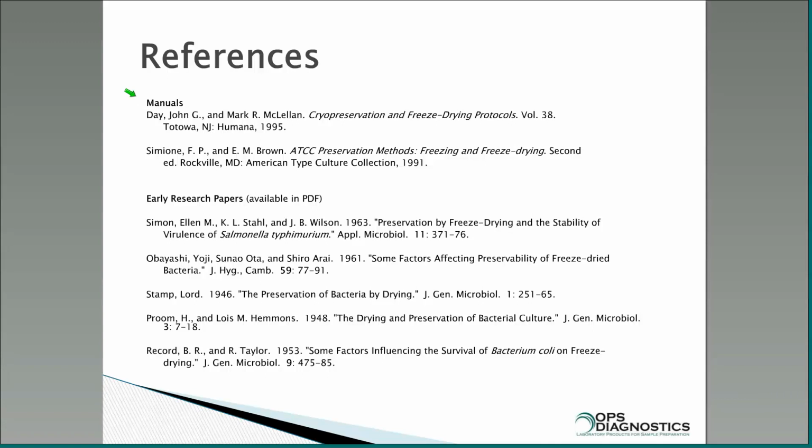All right, so the first question I have is, can you freeze dry multiple strains of a bacteria in a shelf dryer without cross-contaminating? In true aseptic technique, I would say no. In practice, you probably could without too much of an issue.